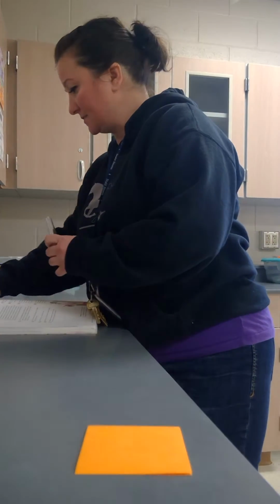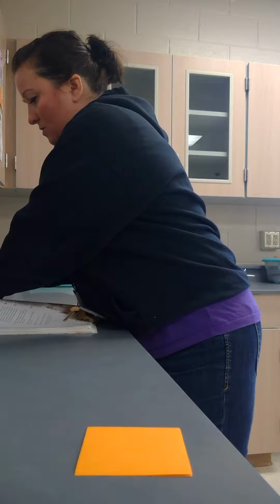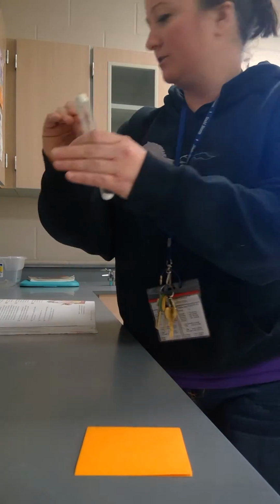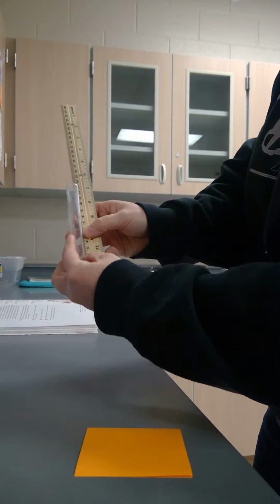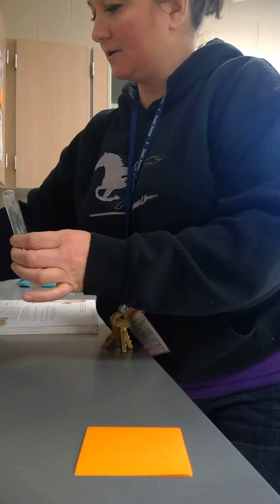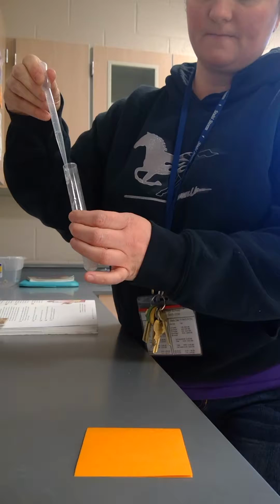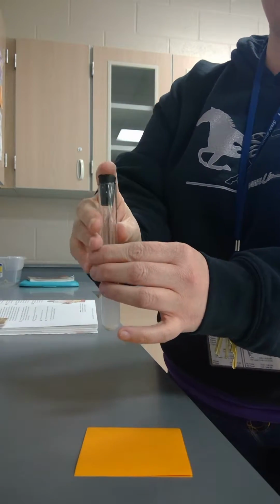Our second substance for today is called zinc oxide. So again, I'm going to pour in 1 scoop of our substance, zinc oxide. In it goes. And then just like before, I need 5 centimeters of water. So I put that into the container. When I place the stopper on, I'm going to gently set it on top and lightly tap, and then I'm going to hold it with my finger, and here I go.